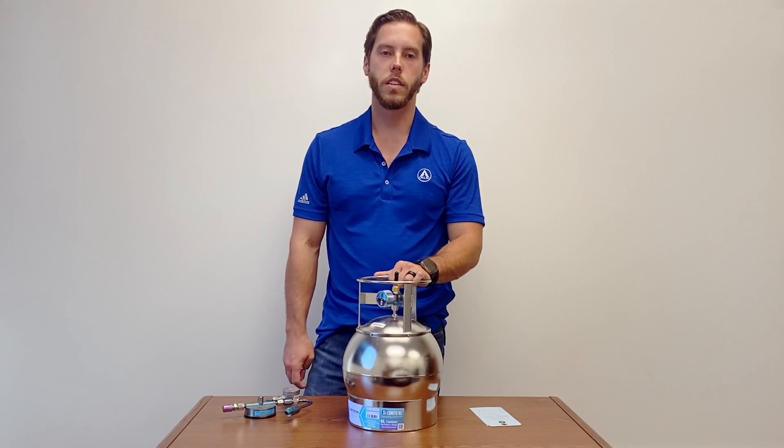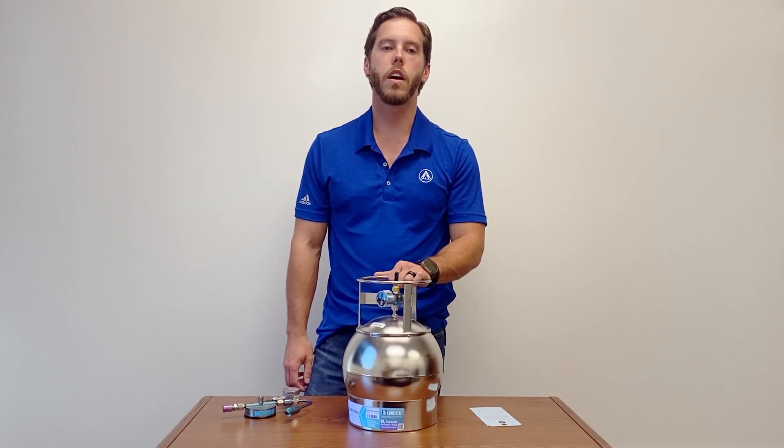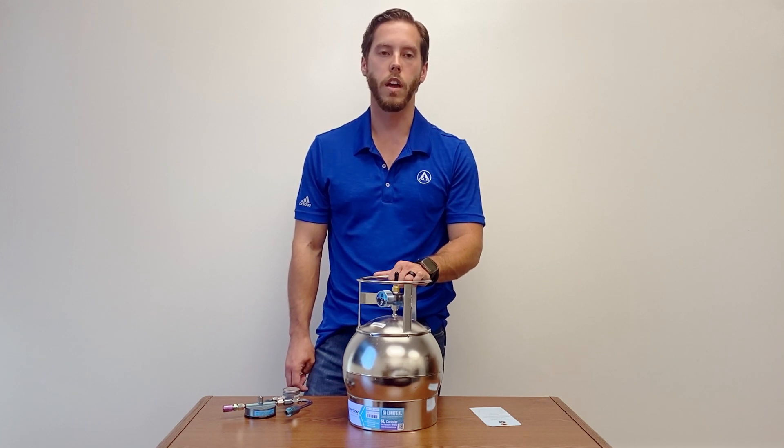Hi there, my name is Alex. I work at ALS Seaman Valley. Today we're going to be talking about how to use a SUMMA canister to collect air so it can be sent for analysis by our laboratory.